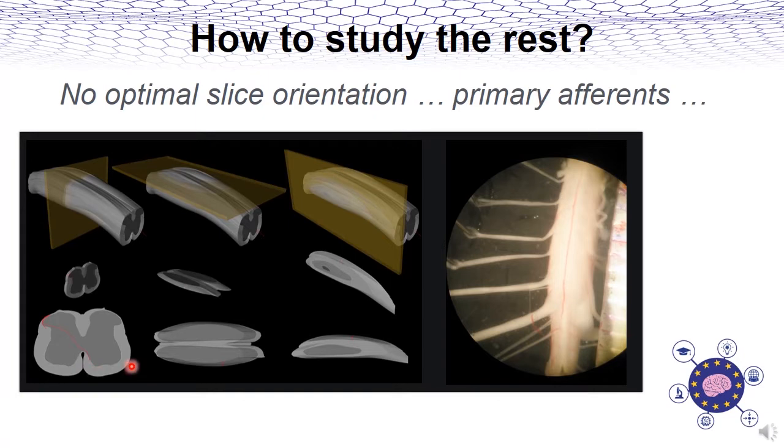The other important problem is that the dorsal roots carrying peripheral input to the dorsal horn circuitry terminate in an angle, spreading like a fan along the whole rostrocaudal length of a particular segment. Slicing will reduce primary afferent input to dorsal horn neurons in an in vitro preparation.